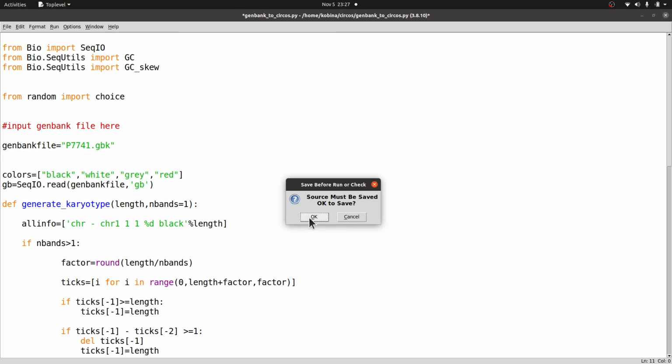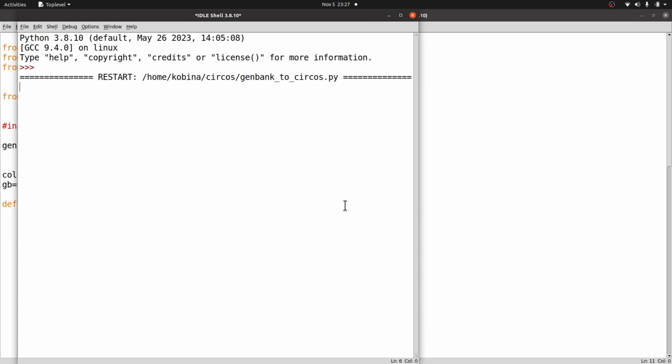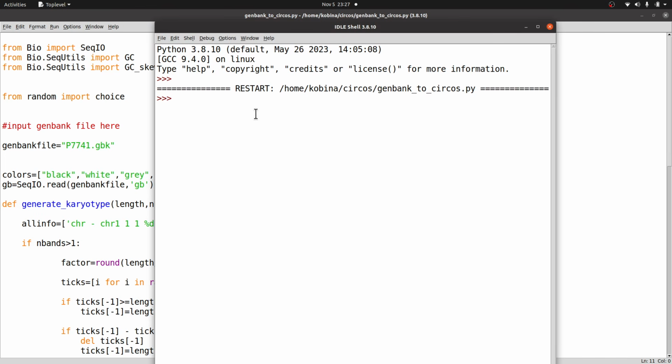So first of all, let's run this code to get our input files. Okay, that has been done. Nothing will be displayed here by default because I made it that way, but I think I'll modify it so that when you download, you see some files or some text being displayed. That will help you. Right?